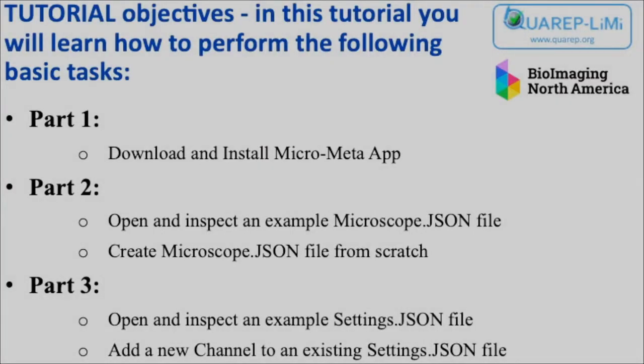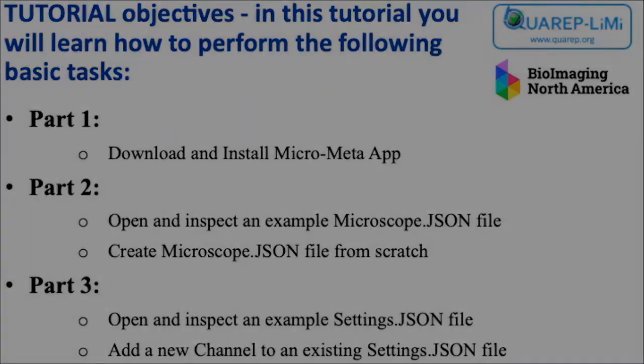In part 1, we will learn how to download and install the Micrometa app. In part 2, we will learn how to open and inspect an example Microscope JSON file, and then we will learn how to create a Microscope JSON file from scratch. Finally, in part 3, we will open and inspect an example settings JSON file, and then we will learn how to add a new channel to the existing file.